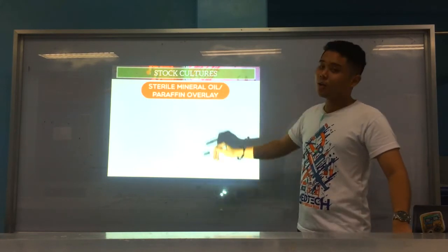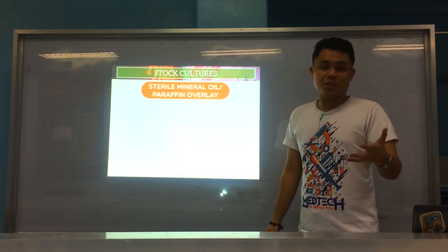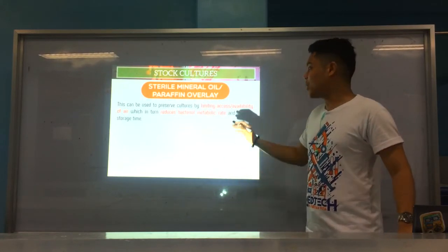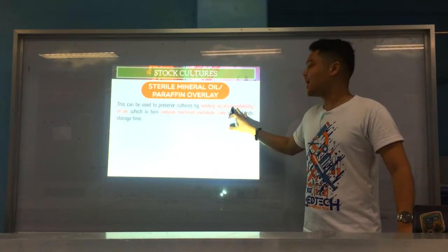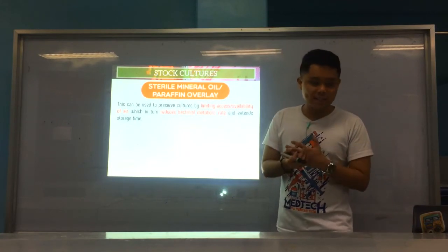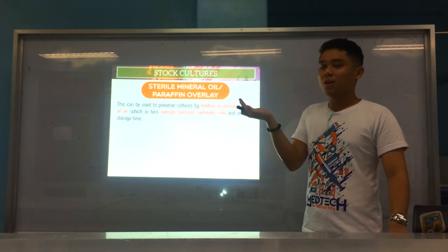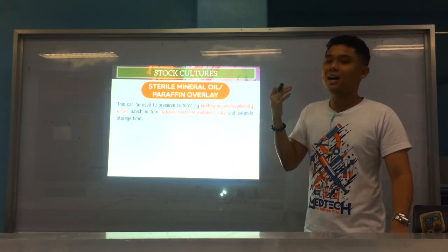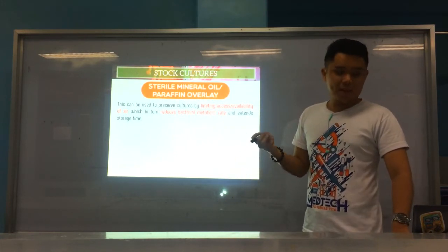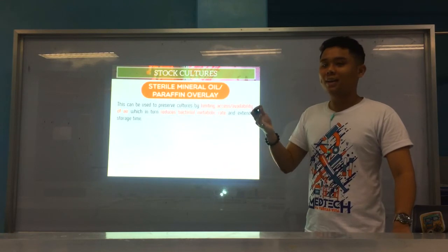Okay, now we go to stock cultures. Right? We mentioned that for stock cultures we want to preserve for further studying or for future studies, right? So we have a method here. We use a sterile mineral oil or paraffin overlay. Now this would preserve the culture by limiting the access of air to the bacteria, therefore reducing their metabolic activities because they have no air. Alright, but basically your paraffin or mineral oil promotes an anaerobic environment so that the bacteria do not continue using oxygen, so they do not metabolize, work or multiply, alright?